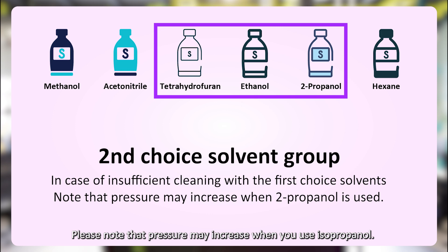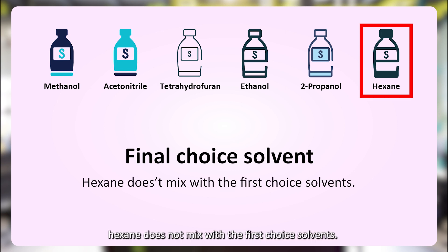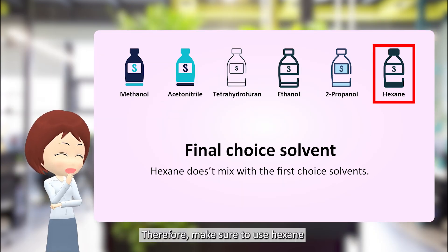Please note that pressure may increase when you use isopropanol. If the cleaning with the second choice solvents is still insufficient, use hexane as the final choice. However, hexane does not mix with the first choice solvents. Therefore, make sure to use hexane after applying any of the second choice solvents.